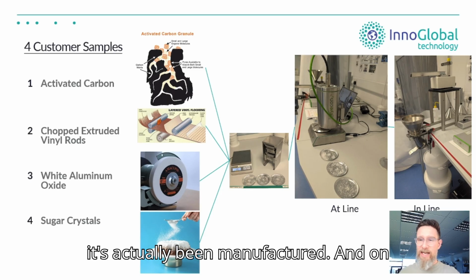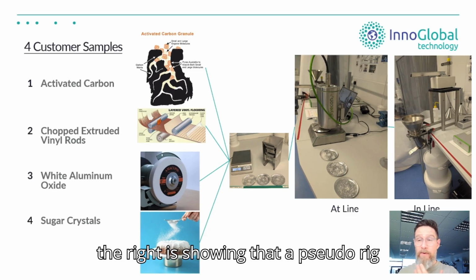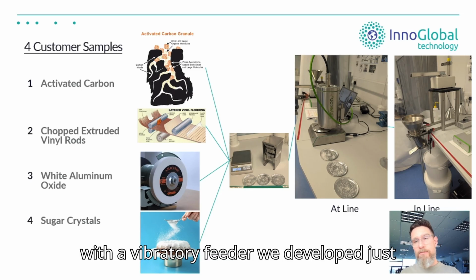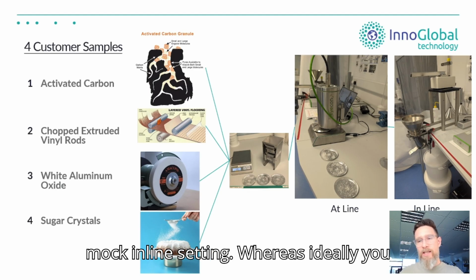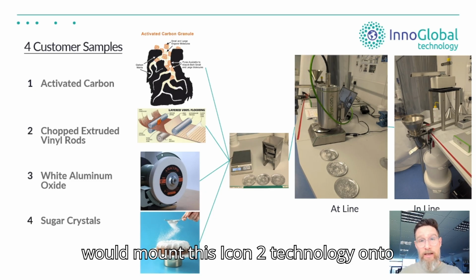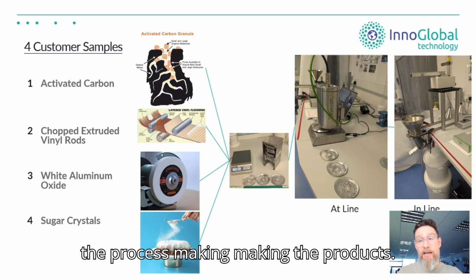And on the right is shown a pseudo rig with a vibratory feeder we developed just to test larger sets of materials in a mock inline setting. Whereas ideally you would mount this Eyecon2 technology onto the process making the product.